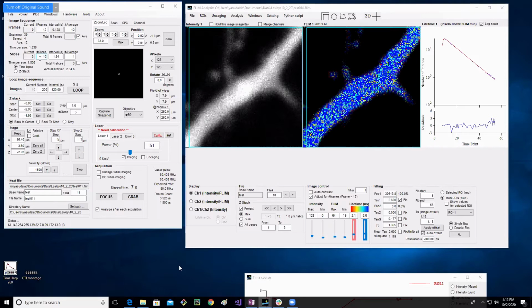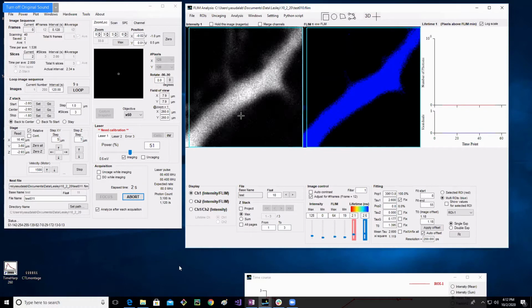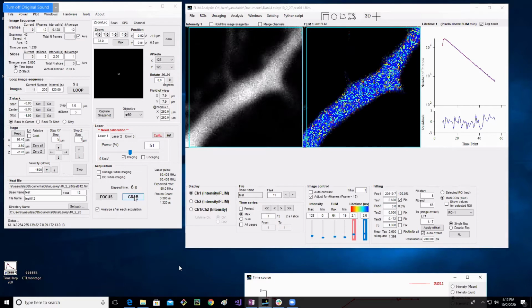So let's say I wanted to take 10 slices, okay? I want them separated by, let's say, 2 seconds, okay? So now it's going to take a set of frames every 2 seconds, from 1 to 10, okay? So if I started this, you'd see that's 1 set of frames. Oh, wait, I'm still, oh yeah, okay. Oh, it didn't change, okay. I was like, why didn't it take 10? Okay, so it just took 2 or 3.